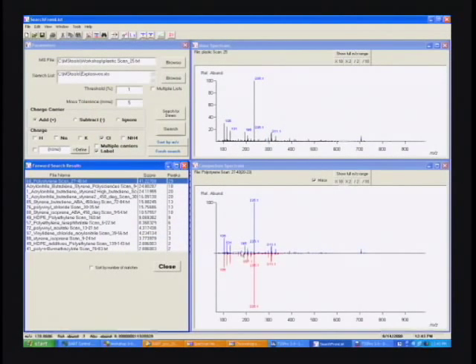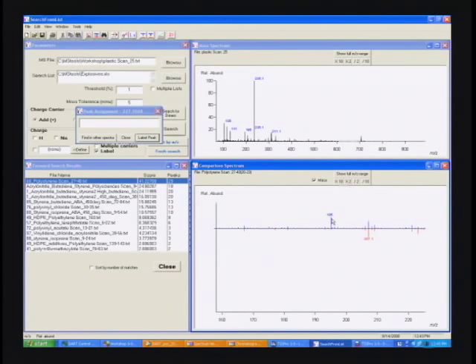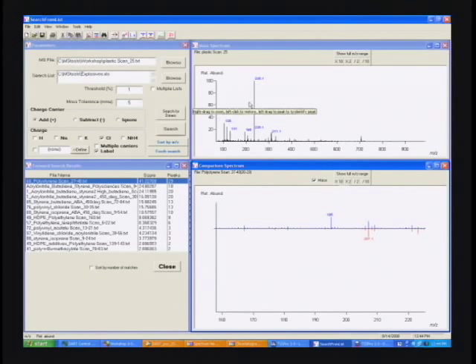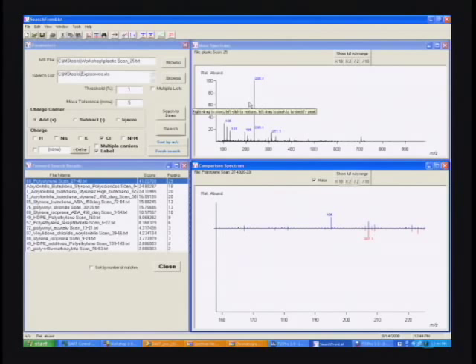So the software identified which plastic we're looking at. And you could also identify other components in there. If you want to look, you can see that the 195 is not in the polymer standard, but that's the caffeine peak. If we were to look at that, we'd identify what it was. So I'll go ahead and stop there and make that an example of how we can identify materials by using dart. The same thing goes for rubber tires or white powders or cosmetics. By having a database of standard dart spectra for each of those common substances, we can identify what kind of tire the skid mark came from or which kind of cosmetics were in a swab. It can be very useful in trying to solve a problem. I'll go ahead and stop, and thank you.